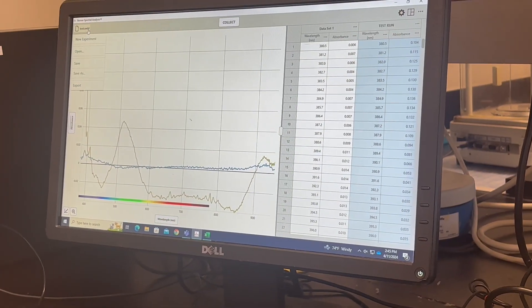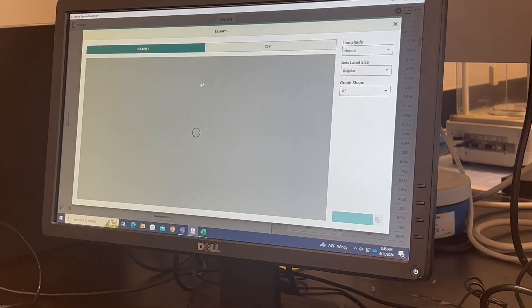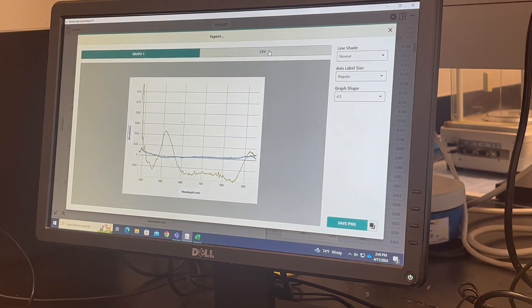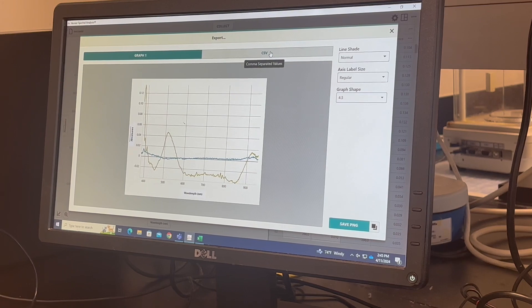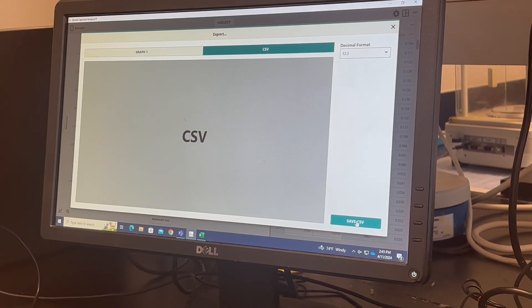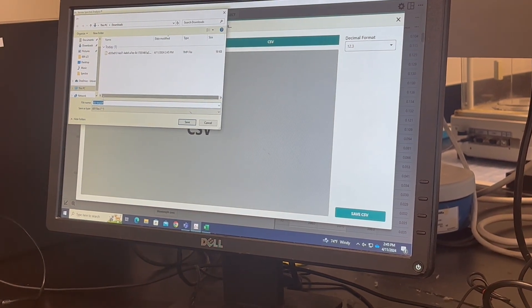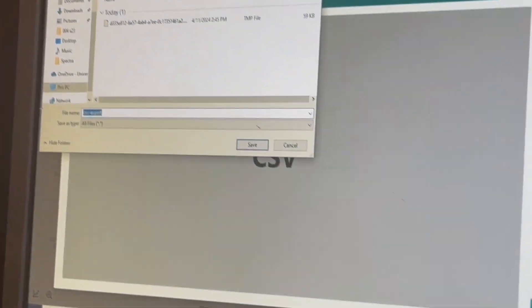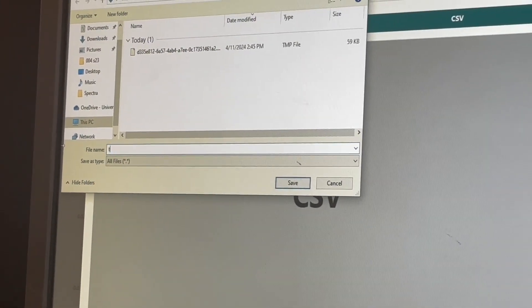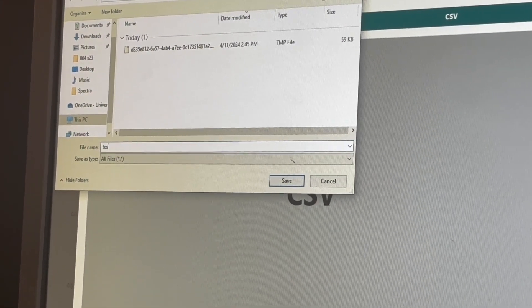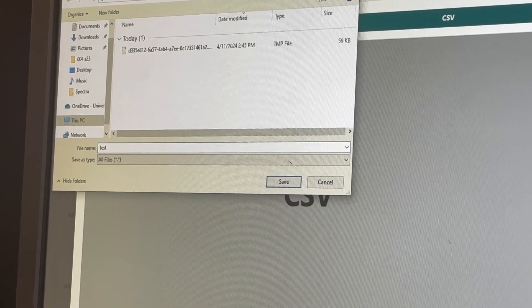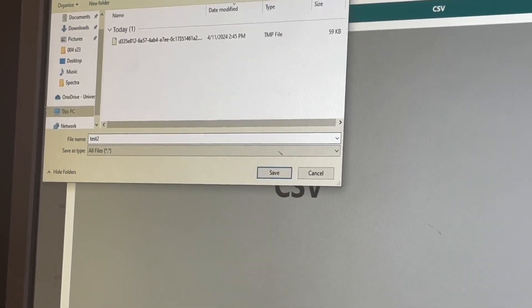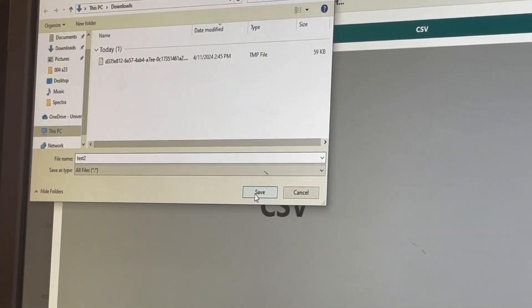So when you want to export this data, you can export for graph one. And then export as a CSV. And then save CSV. And then whatever file you want to save it as. So I'm going to save it as test 2. So save.